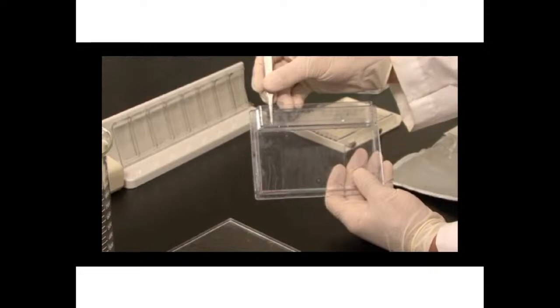At this point, we want to seal the IPG strip and standard gel plug into the well of the gel. I will use Protein Plus Overlay Agarose. Heat in the microwave oven until it boils, and when the temperature of the agarose is no longer hot to the touch, take the agarose and fill up the well. And do this in one rapid action, side to side.